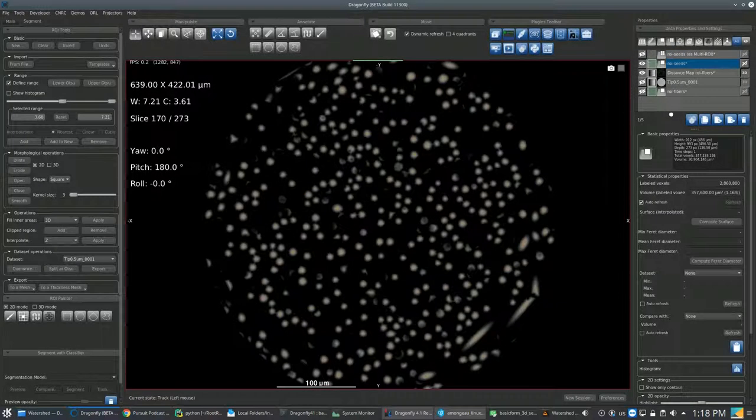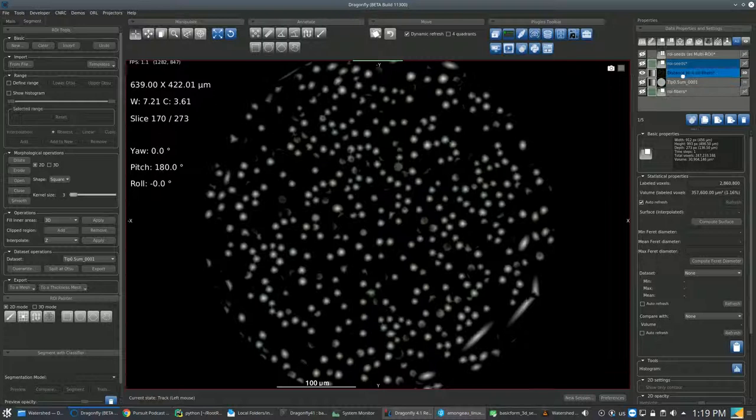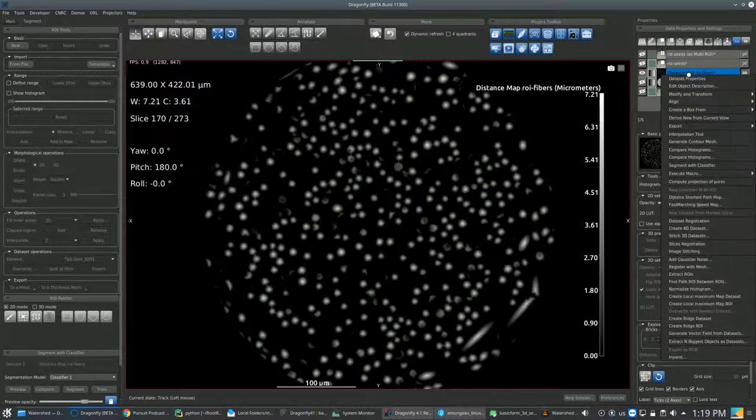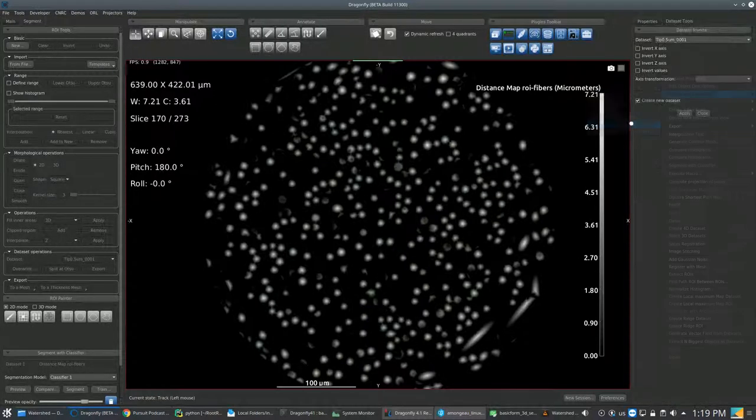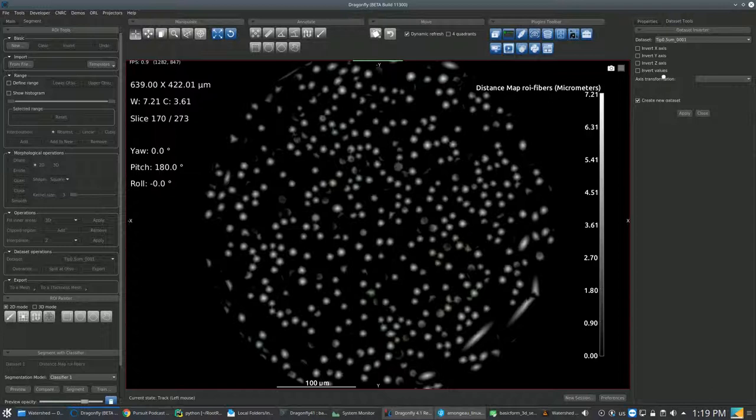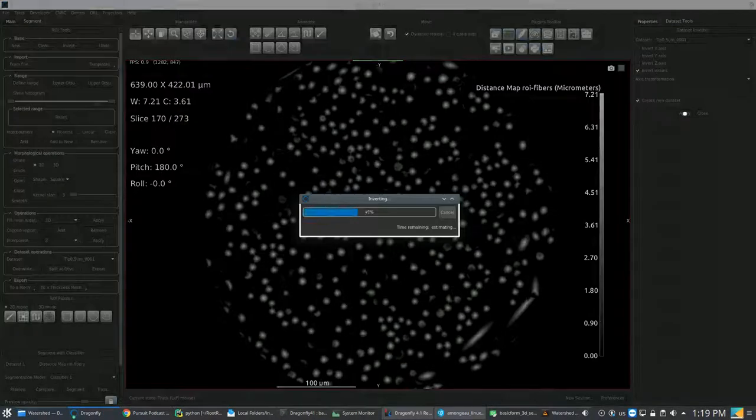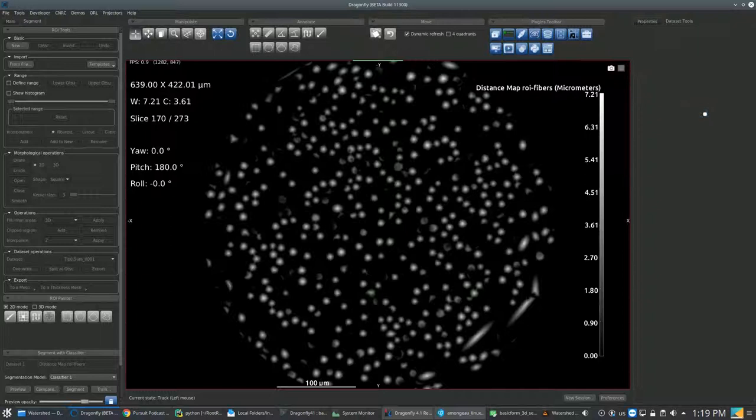Then you go back to the Distance Map ROI. Right-click and go in Modify and Transform and click on the Invert menu item. Then Apply and Close.